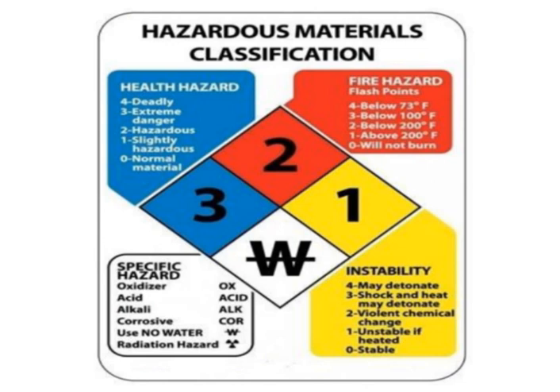Okay. So that's what I've got on this slide right here. In the corner here, it tells you about the health hazard. And it's basically a 1 to 4 scale. If it's deadly, it's a 4. Be very careful with this material. If there's no risk at all, it's a 0. So salt is slightly hazardous. If you just ate salt every day for a week, yeah, we'd have some problems. Right?